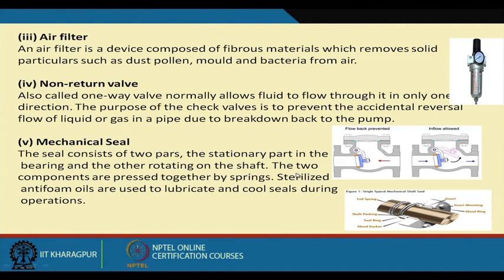The two components are pressed together by a spring, and sterilized antifoam oil is used to lubricate and cool the seal during the operation.